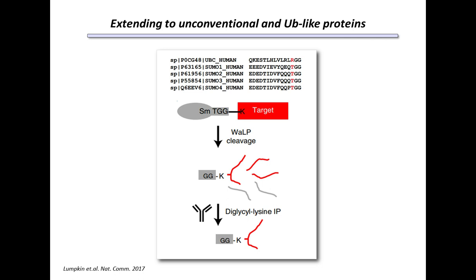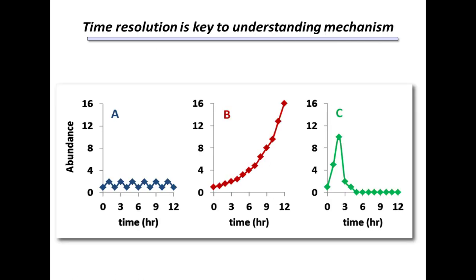We were quite impressed by some of the work that came recently from Betsy Komives and Eric Bennett down at UC San Diego, working closely with colleagues that are part of Cell Signaling Technology to take advantage of a protease that they discovered down at UCSD known as WALP. And what they found with WALP is that this protease cut adjacent to threonine residues and, in fact, could liberate a GG peptide from SUMOylated substrates, making those KGG peptides equally well amenable to KGG enrichment using the technologies that we've been thus far describing and talking about in the context of profiling ubiquitination.